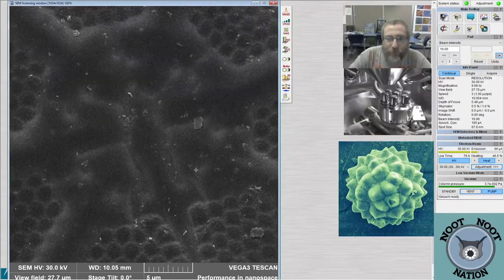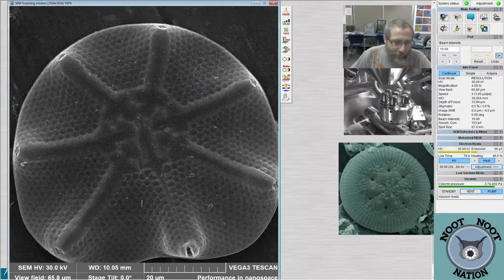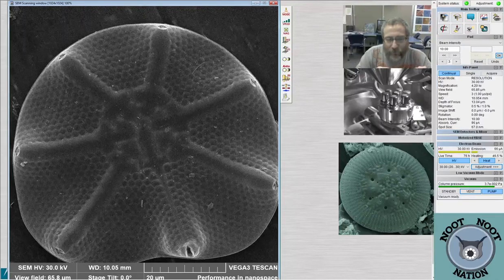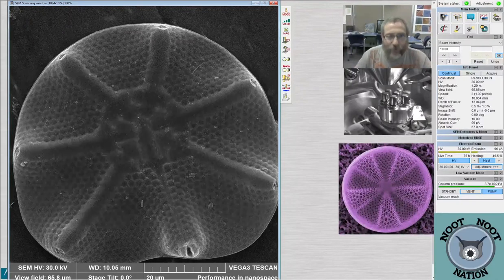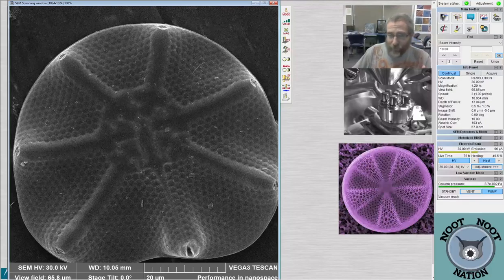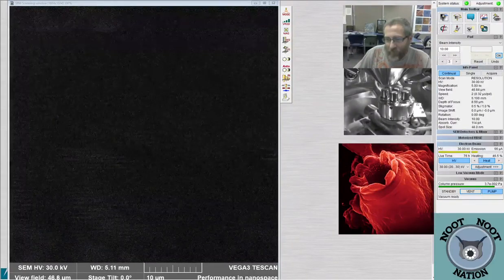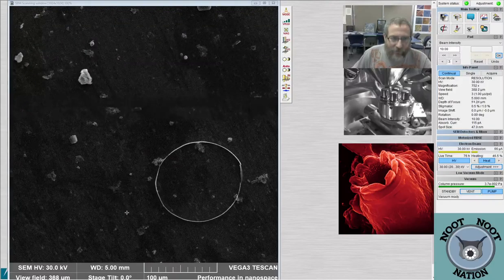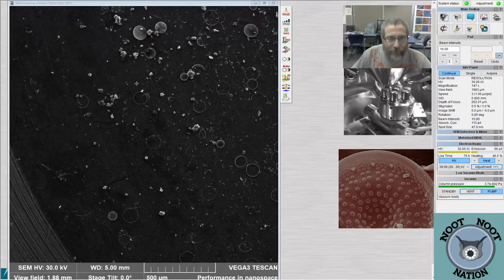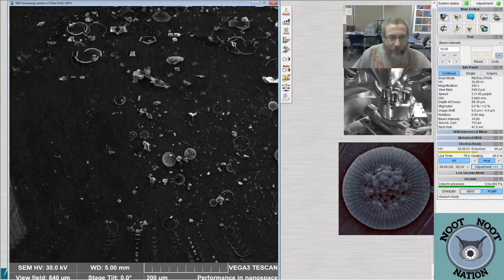Part of the reason I usually zoom in so closely when I'm actually using it, why we sit at 5 sometimes when we're on the streams, is because I'm often looking at some little tiny thing and depth of focus doesn't help. So I can get more detail the closer I get. And so it's always some sort of trade-off. Do I want to get closer and have less of it in focus, or do I want to have it a little bit farther away and have more of it in focus? When you're looking at really tiny things, there's no value to being farther away. You're better off being close because you can see the detail. You magnify things by getting closer to them, right? So that's basically what we've done here. We can get a little bit closer and basically magnify the image as a result. It's moving just a little bit when I do that.